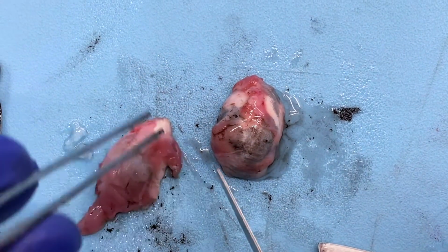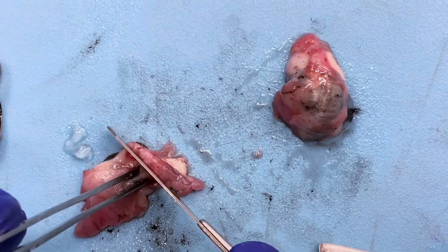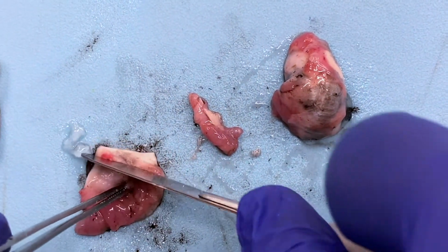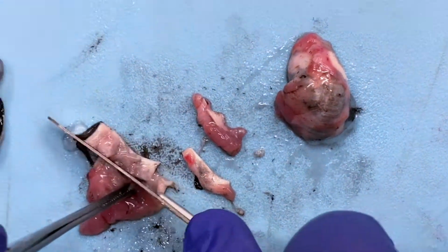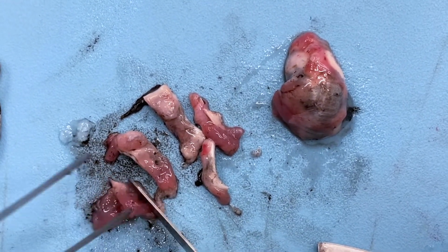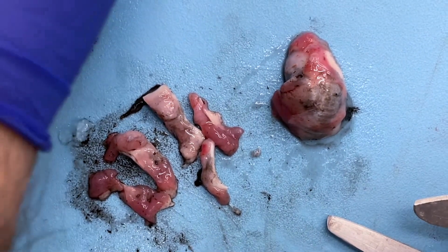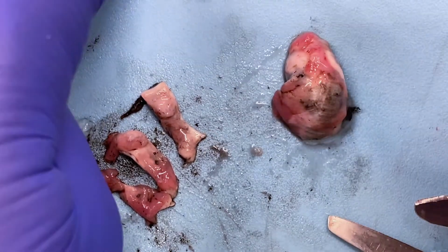So let's go ahead and do that. Usually they're small enough that you can just stick them in a single cassette on edge.